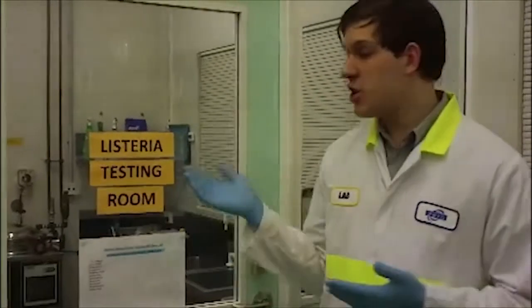Okay guys, this is the microbiology lab where I work and just behind me is the Listeria testing room, which is a controlled area in the lab. Today we're just going to walk through how we test for Listeria in food products.